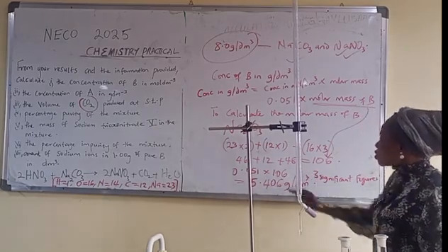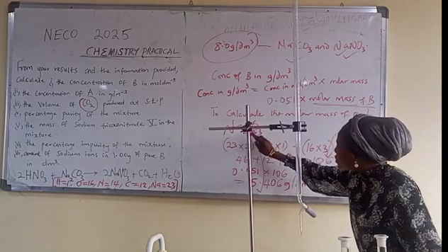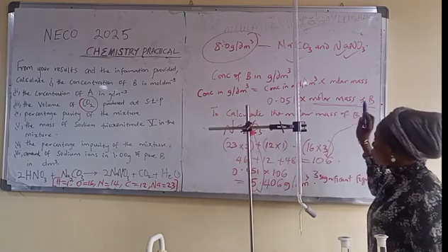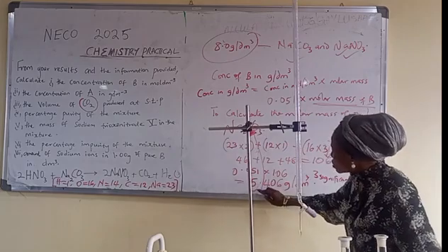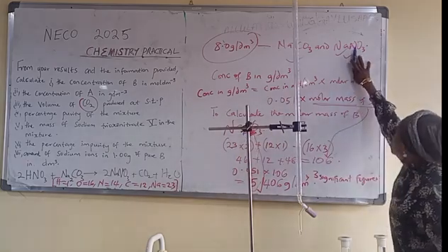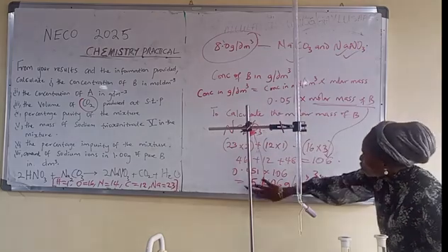Okay. So we have known this one. So this one is for only sodium carbonate. This value now is the pure concentration of this, without considering the sodium nitrate. So this is the pure mass.